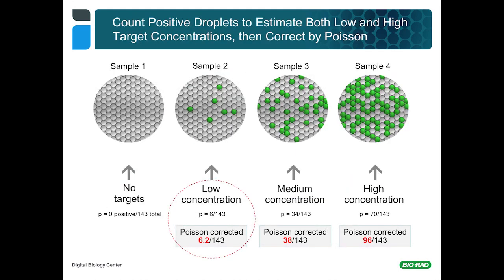So there's a rich suite of software behind that, many other sorts of charts that can give you concentrations per sample, that can give you copy number measurements or fractional abundances of mutations and so forth, as you'll see as we go through the presentation further.